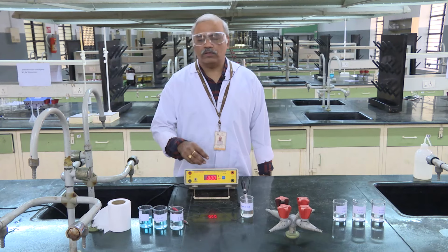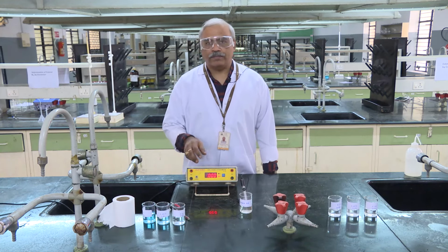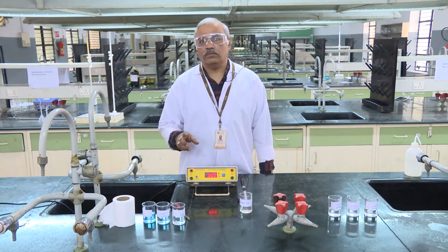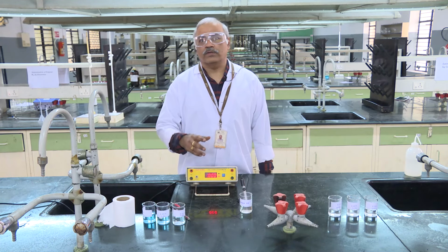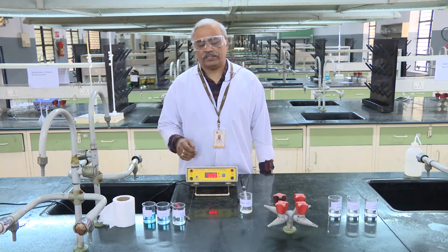With respect to that, we are going to measure the EMF of the zinc and copper systems. In the second part, we are going to put the zinc and copper systems together to make a Daniell cell, record the EMF values, and then go for the other thermodynamic functions.